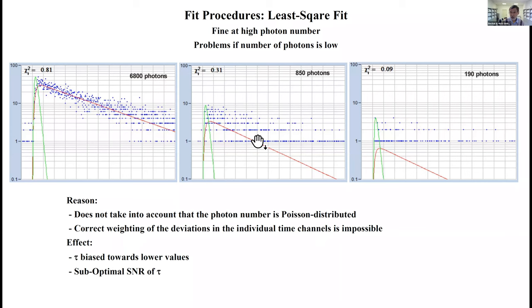But when the photon number becomes very low you run into a problem as you see on the right. The reason is that the least square fit is not able to take into account that the photon number is Poisson distributed. It's impossible to provide a correct weighting of the deviations in the individual time channels, and you don't get the optimal signal to noise ratio. What also happens, the lifetime is biased towards lower values if you have low photon numbers. This is not what you want.